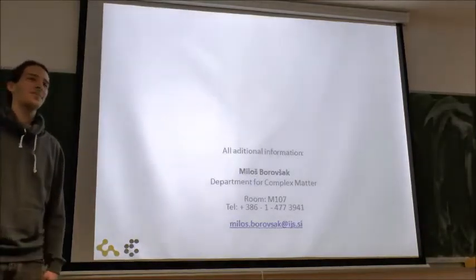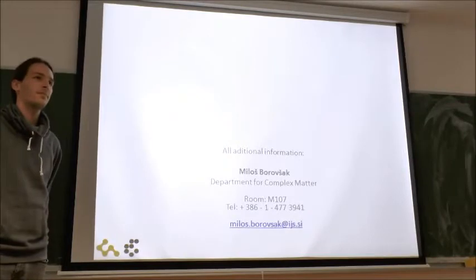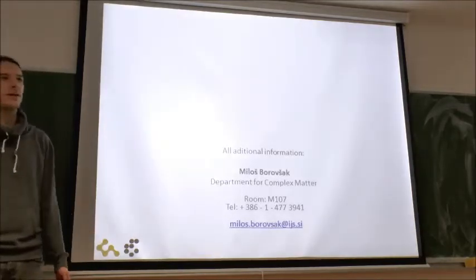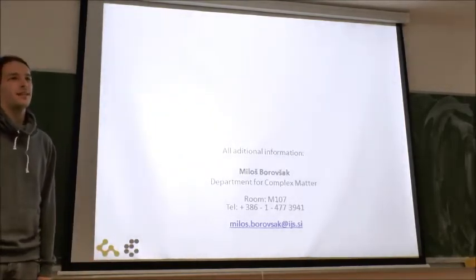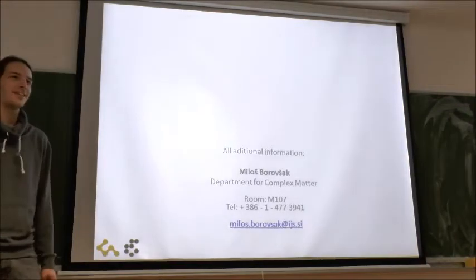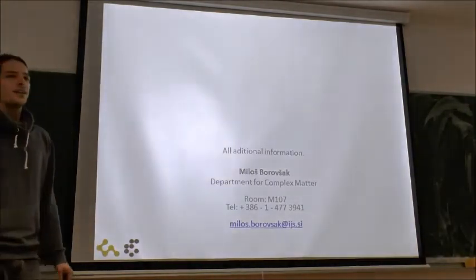I have two questions. The first one: what is the typical enhancement factor that you get in this method? And second, can you also make measurements with samples in liquid? The first question: the enhancement is around 5 to 15 times, so one order of magnitude, that's typical. I mean it can be better, but with the tips we made here we didn't achieve a bigger enhancement yet.